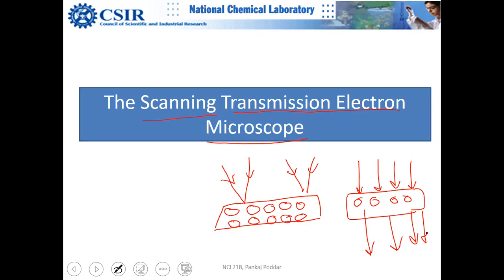You do not get the information from your tiny selected area, so the area under the probe becomes smaller here. That is the advantage. Here you don't need to scan the beam. You can just magnify, demagnify, and select another area.